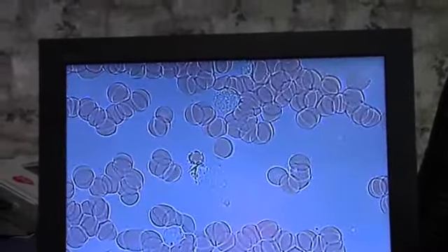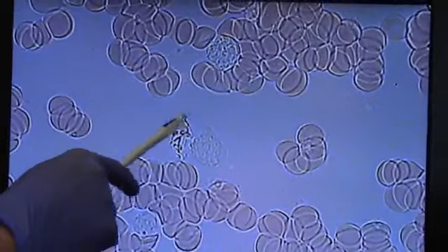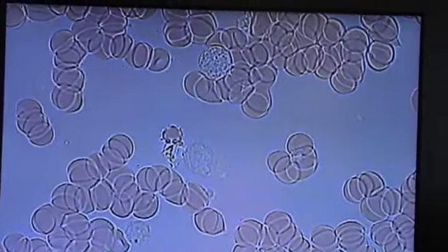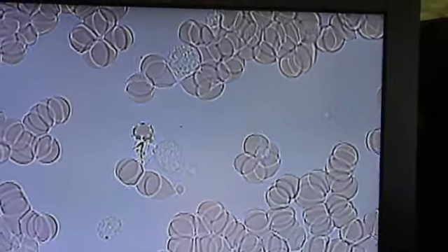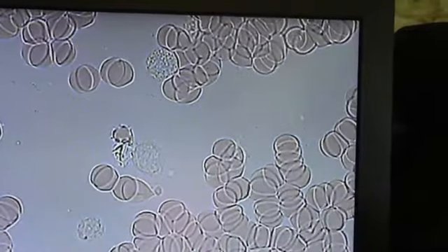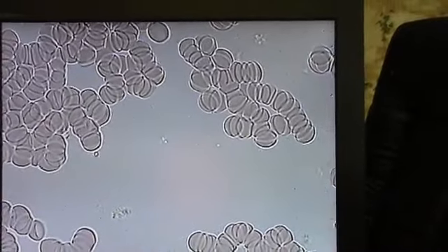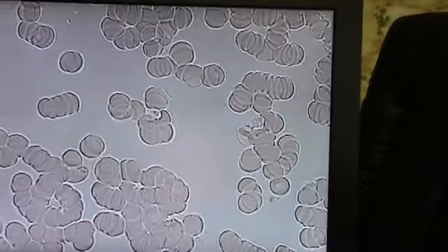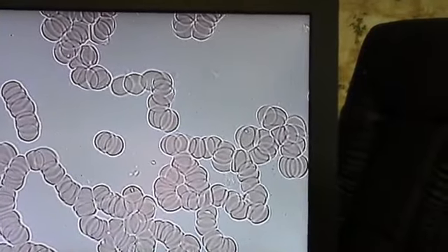We got a couple things right here at this juncture. We got a white blood cell here, a little bit of uric acid. And when you see these spiky looking cells like that, they're called hepatic spur cells. Hepatic meaning they're coming from the liver. They're showing some signs of liver stress, liver congestion, which would make a lot of sense, with all that excess protein in there putting a lot of stress on the liver in the first place. And vice versa, if there's a lot of toxicity and congestion in the liver, it's not going to help process the proteins as well. Don't you get the rouleau with high inflammation? Well, it can end up causing high inflammation for sure.